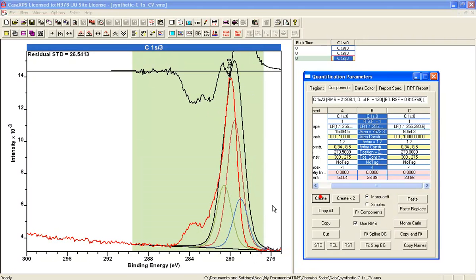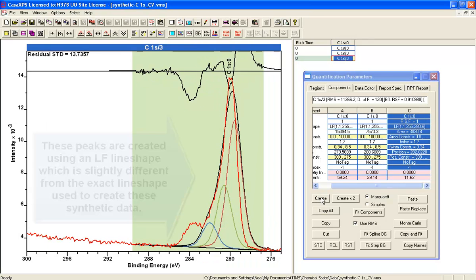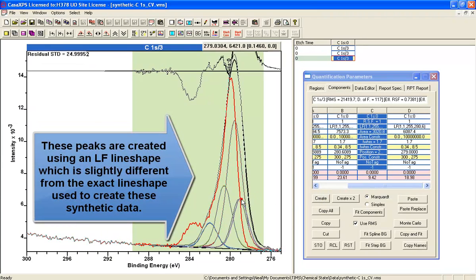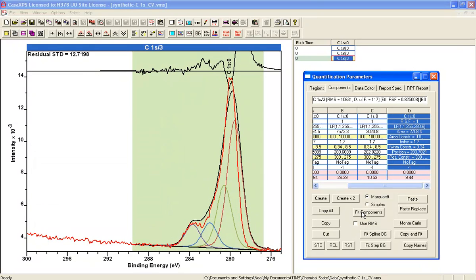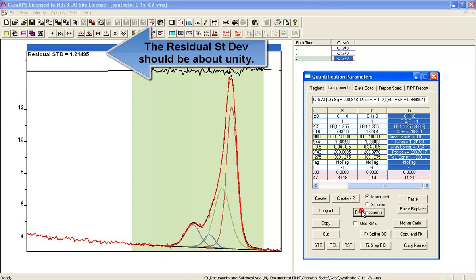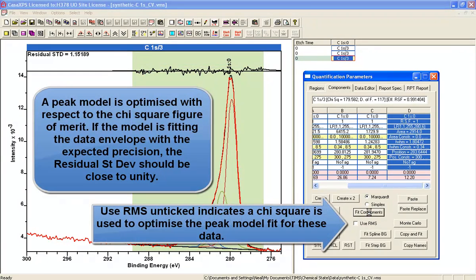In the first instance, the line shape is not quite the same as the one used to create the data. So we have a slight perturbation to the system based on the line shape. So now if we fit this, we obtain a chi-square. And because the line shape isn't exactly the one that was used, we don't get exactly a residual standard deviation of unity.